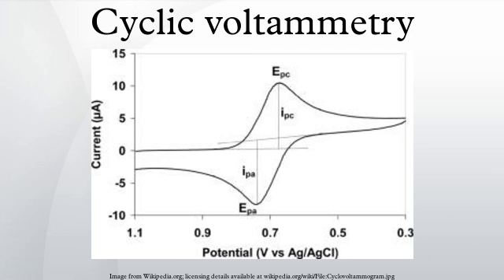Antioxidant capacity of chocolate and hops: the phenolic antioxidants for cocoa powder, dark chocolate, and milk chocolate can also be determined via cyclic voltammetry. In order to achieve this, the anodic peaks are calculated and analyzed with the knowledge that the first and third anodic peaks can be assigned to the first and second oxidation of flavonoids, while the second anodic peak represents phenolic acids. Using the graph produced by cyclic voltammetry, the total phenolic and flavonoid content can be deduced in each of the three samples.